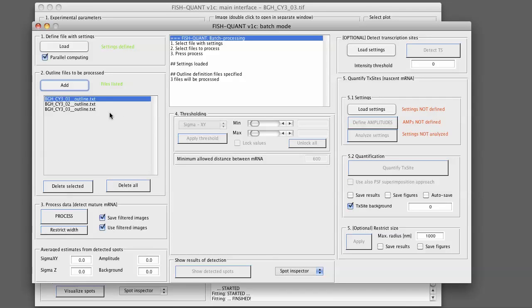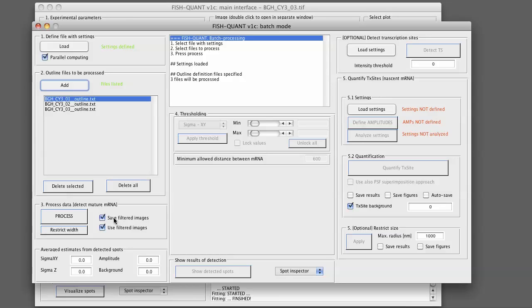We could now already process those files. One thing that will happen is that we do not have any filtered images yet. They will be filtered based on the settings that we specified. We have here two default settings. Save filtered images simply means that those filtered images will be saved in the same folder than the raw images. And FishQuant will automatically generate new outline files that reference those filtered images. This means that if you want to reprocess those files you don't have to go through the filtering step again.